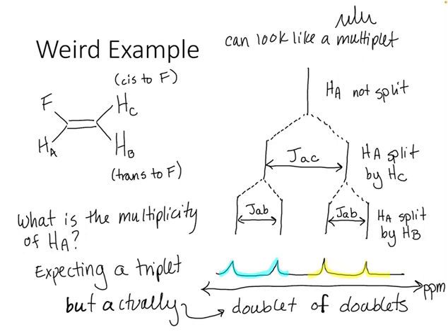All right, so if you do see this doublet of doublets where you don't have a traditional quartet where the 2 middle peaks are really tall, then you might have a situation like what we saw here where you have an alkene maybe, or you just have 2 different hydrogens next door. So just keep that in mind.